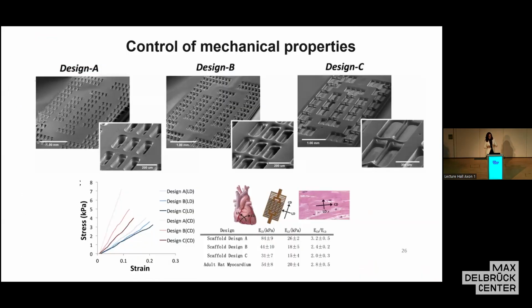The nice thing about controlling polymer structure is that I have different ways of controlling mechanical properties. One way is through chemistry. Depending on the ratio of monomers in this elastomeric polymer and how much time I cross-link, we are going to get a certain Young's modulus.